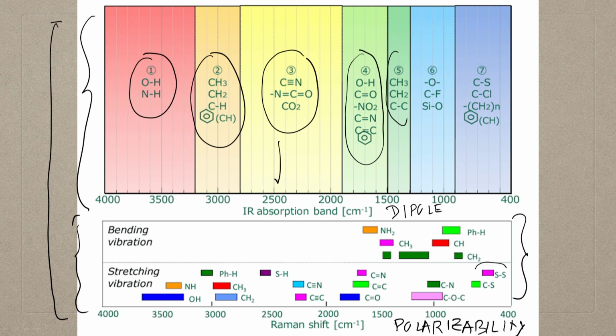And if you look at it, most of the compounds here, the signatures are better for all the homonuclear complexes, and here you see in the IR, this is the zone. This is extremely important, so try to have a mental map of this particular slide.